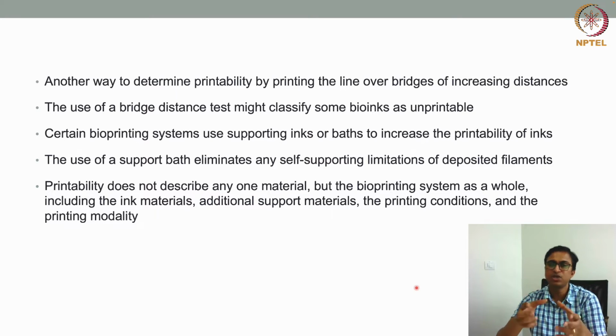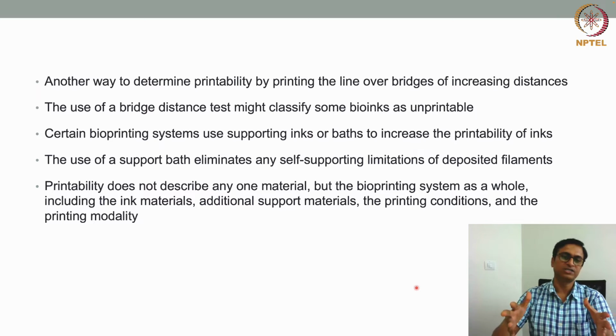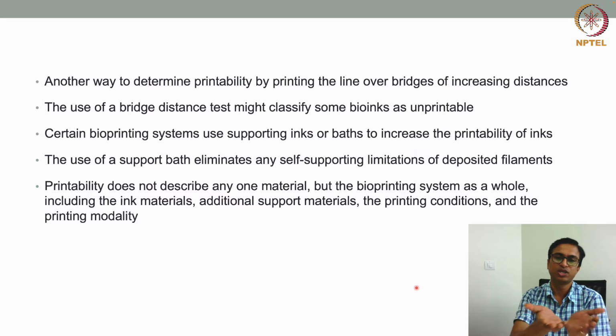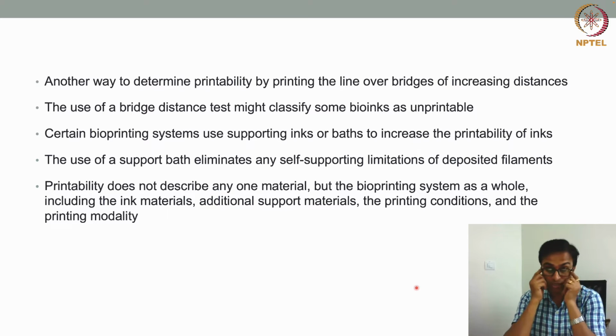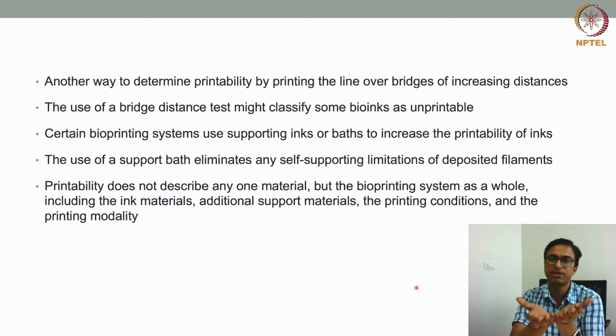Support bath materials are like Bingham plastics, where they are solid unless you put a pressure on them. When you dip the nozzle in and print the structure, plotting the material within the support bath, the support bath holds the material, because when the pressure force is gone, they again become solid.